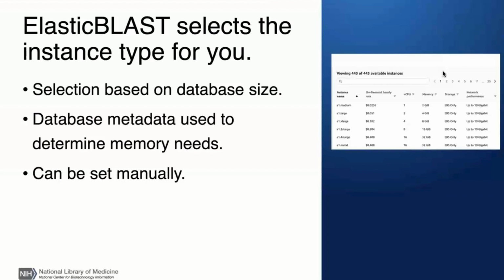Now, the most important question about whether an instance will work for BLAST is whether it has enough memory. The question then becomes, how much memory do you need to run a BLAST search? And the answer is that it depends upon the database. So basically, you have to have enough memory to hold the database in memory, and that determines which instance you want to use.